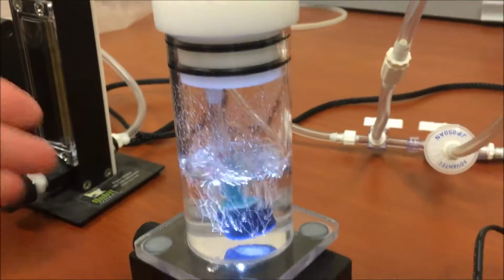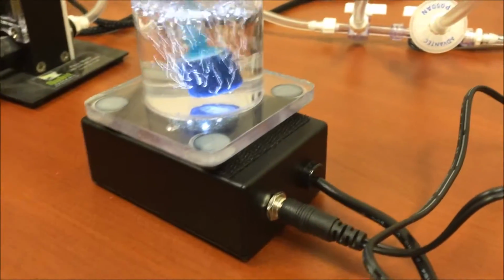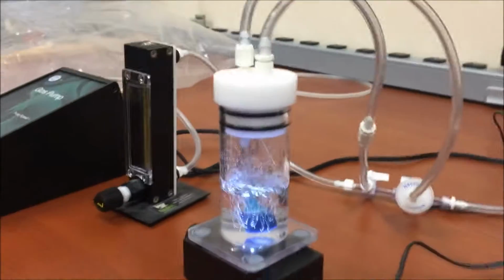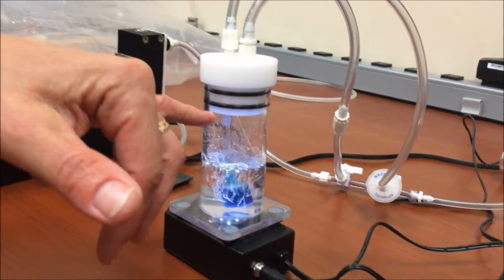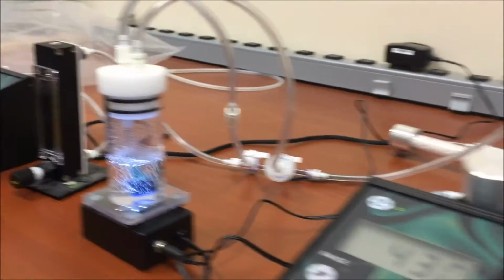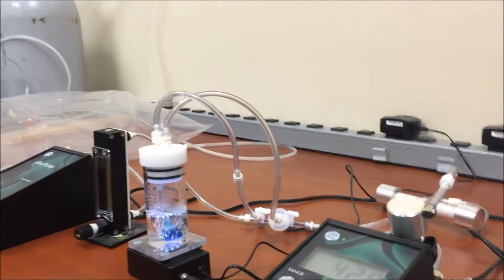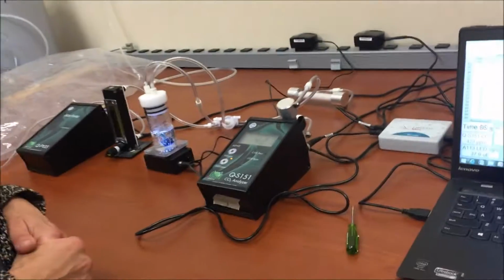And what happens is the reference gas will bubble through our culture of algae, which will be using up the CO2 that's available to it, and we would see a decrease in the CO2 that's being measured, because what is not used is carried to the CO2 analyzer and measured. Because I don't have a culture here in the chamber right now, we're not going to see that, but that is what we're doing. So this is the basics of our algal CO2 package.